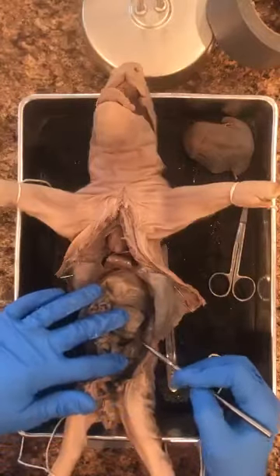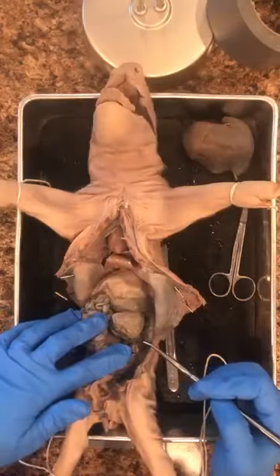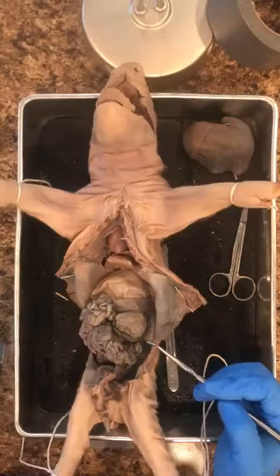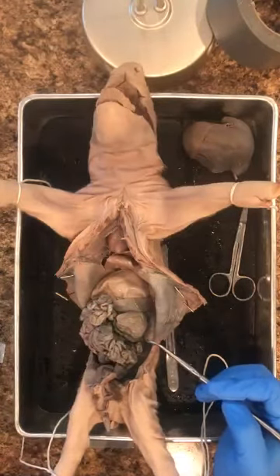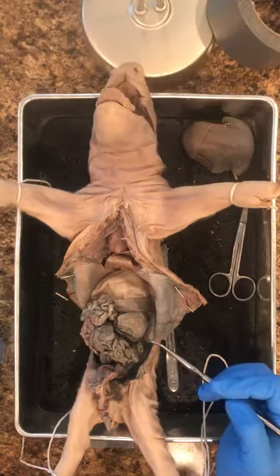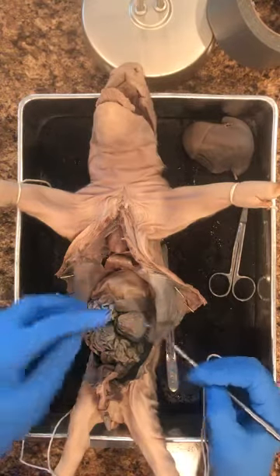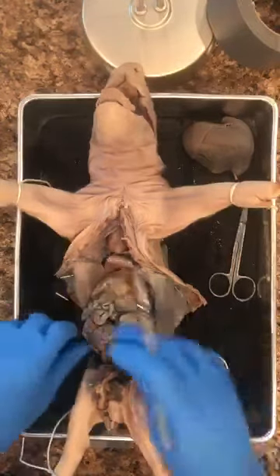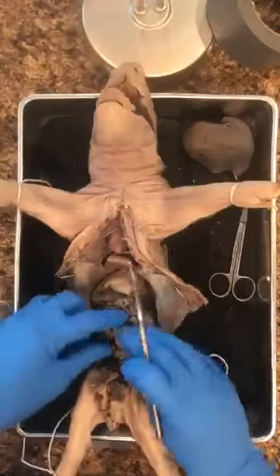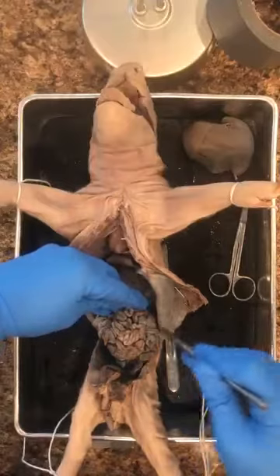It's kind of greenish, so that means it is nice and full. That's the large intestine. This is one of the very few differences between the pig and the human. The human large intestine forms a loop around the outer portion of the abdominal cavity, where this one is all spiral shaped and together. If this was one of us, the small intestine would be here, and the large intestine would form this loop around it.